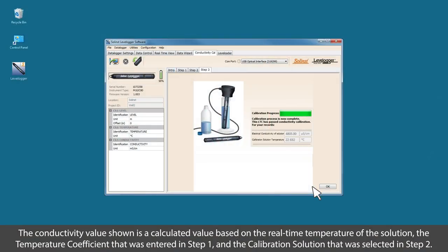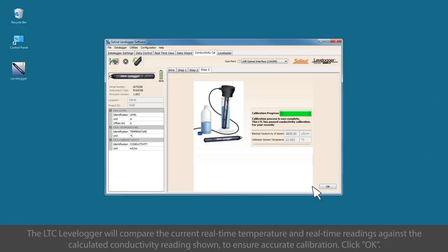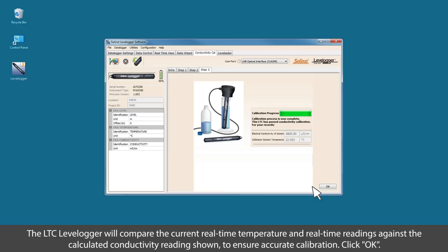As before, while the logger calibrates, two values will be shown on the screen. The real-time calibration solution temperature and the calculated electrical conductivity of solution. Again, the LTC Level Logger will compare the current real-time temperature and real-time readings against the calculated conductivity readings shown to ensure accurate calibration.